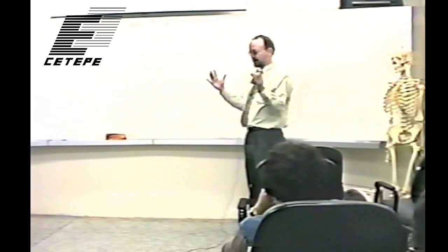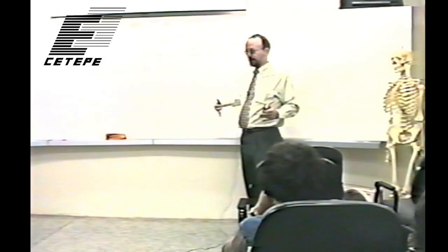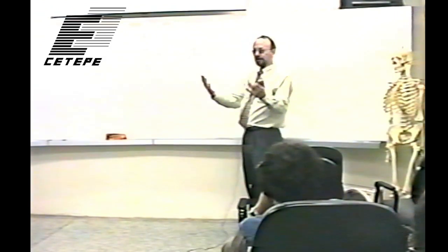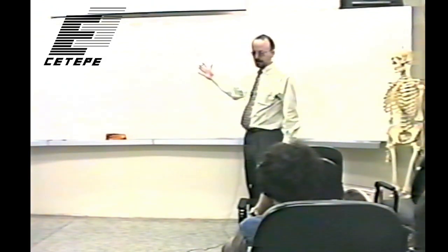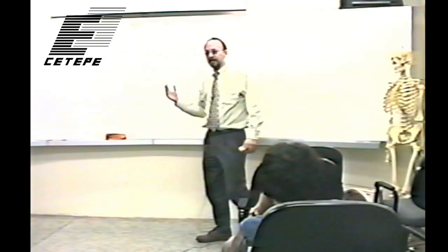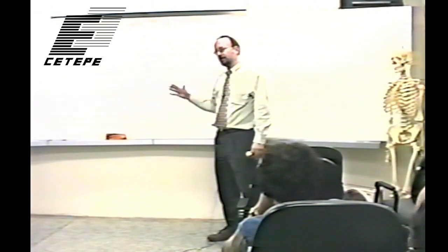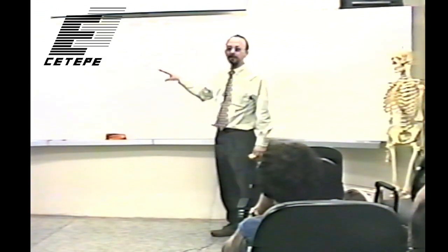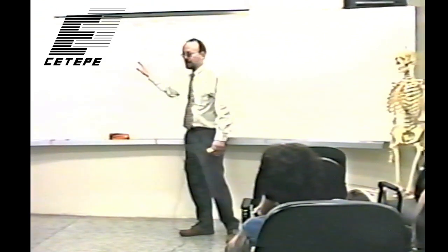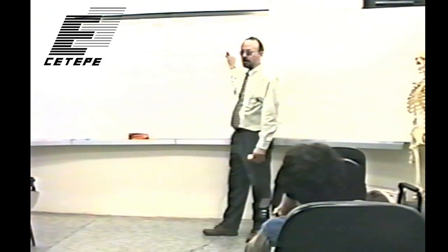if you look at these images visually, if you look at images of a brain or fluoroscopic images through any part of the body, they're very pleasing to look at. They're high contrast, great detail, because these devices are so highly perfected. But if you want to do CT, there comes into play one of the weak points of this device, which is there is a marked geometric distortion of the X-ray pattern because of the inability of these focusing optics to properly focus the electrons on the output window.